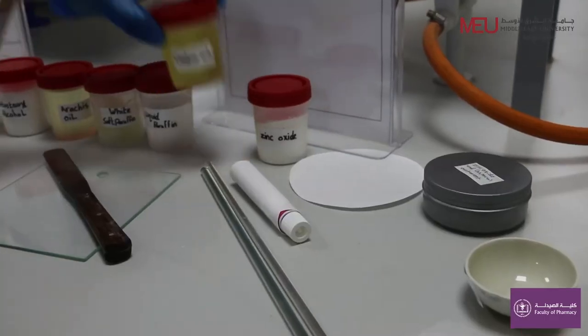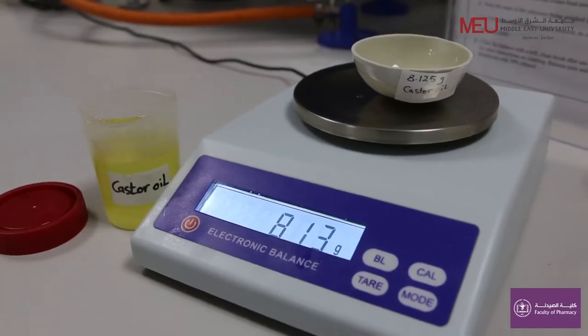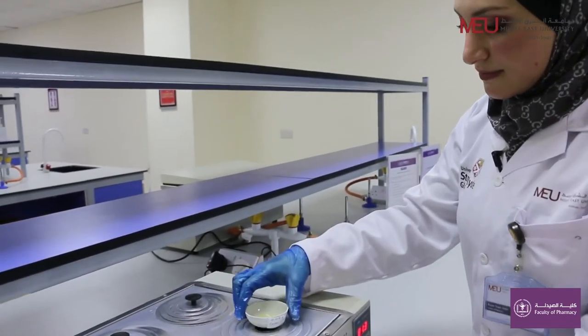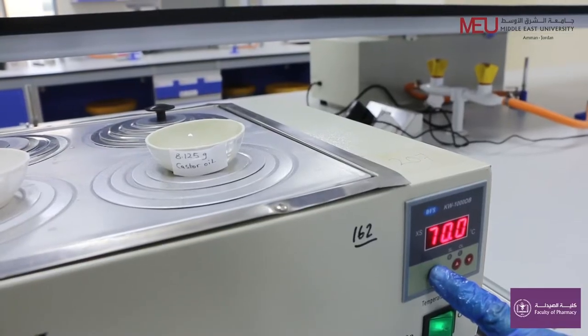Weigh 8.13 grams of castor oil in a separate evaporating dish. Warm the castor oil using a water bath to about 70 degrees Celsius.